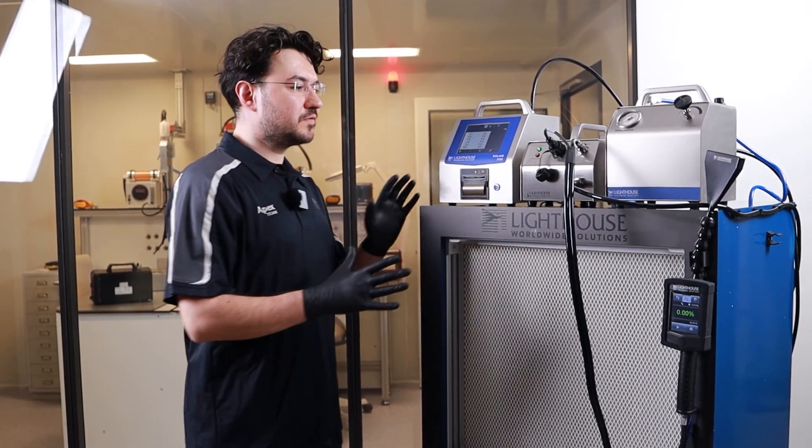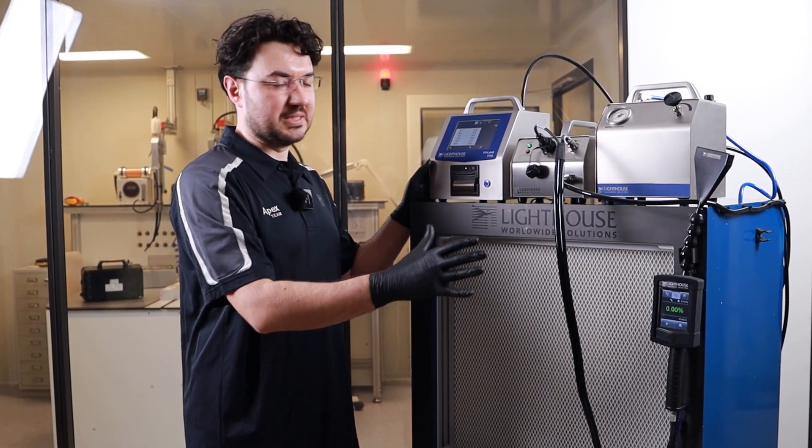Hello, today I will introduce you to the Lighthouse Scanner Pro filter testing equipment. Lighthouse filter testing equipment comes with four pieces.